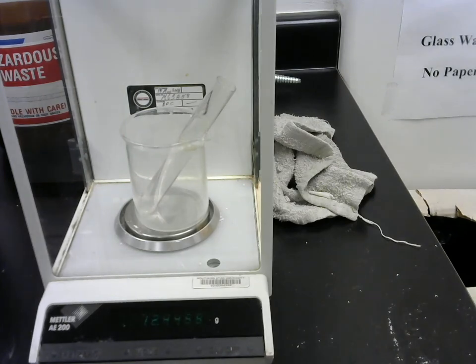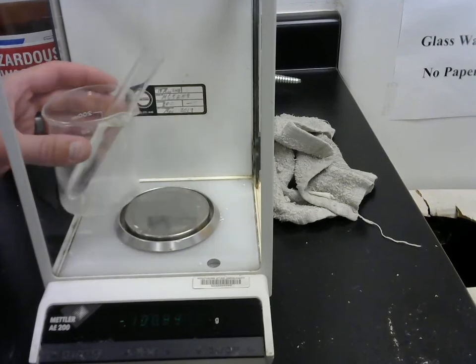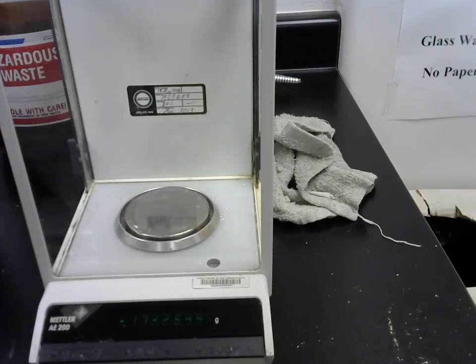We'll let that settle, and you can see there the mass of the cyclohexane that we added is 12.445 grams or so. It's fluctuating a bit in that last sig fig. So we'll call it 12.445 grams. Set that aside and put on some weigh paper.